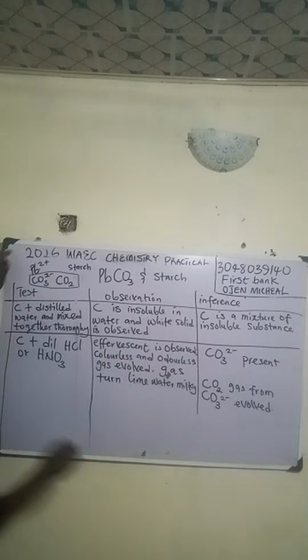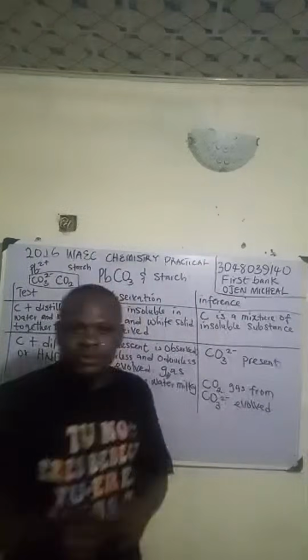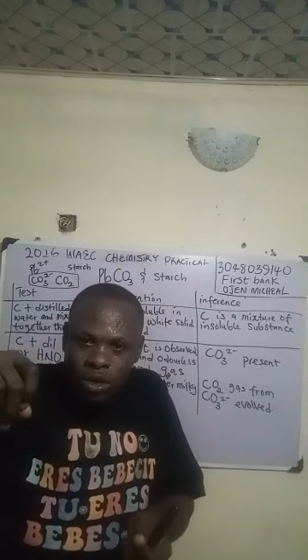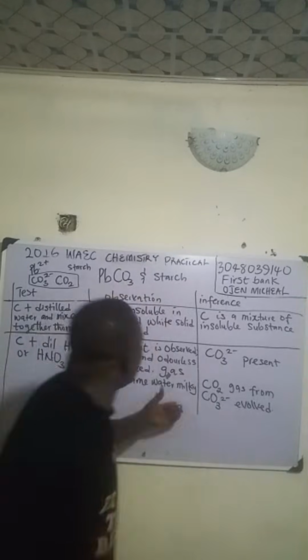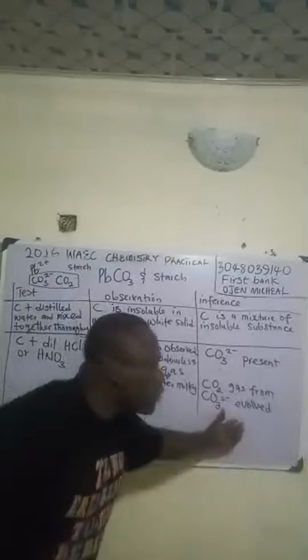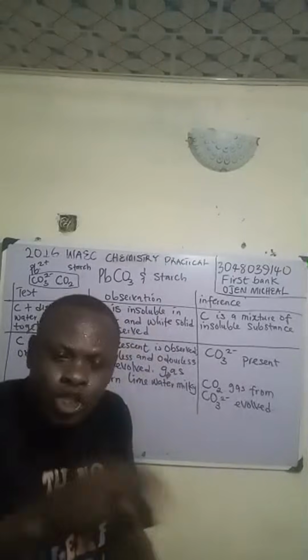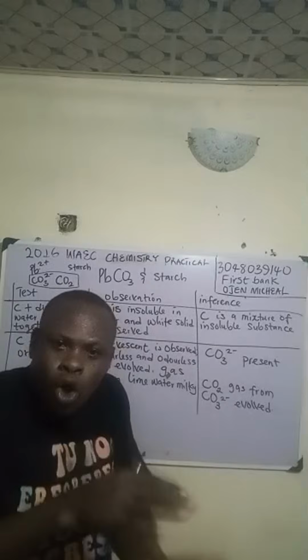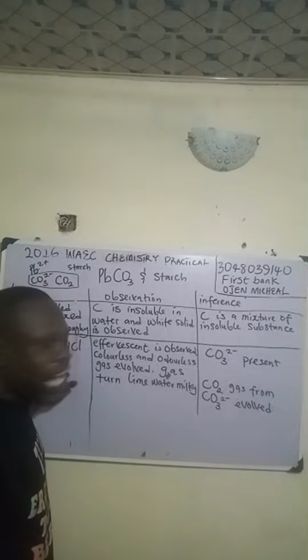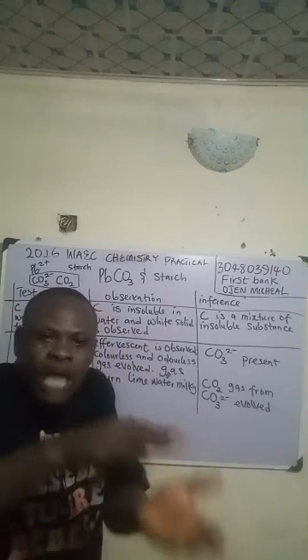Now, you will be asked to filtrate. When it happens like that, you need to filter it. Alright, filter because the mixture contains starch. So starch will go down. If you put any of the acid, starch will go down. That starch is called residue. If you add either HCl or HNO3, it will go down. Starch will go down, while the other one will go up.